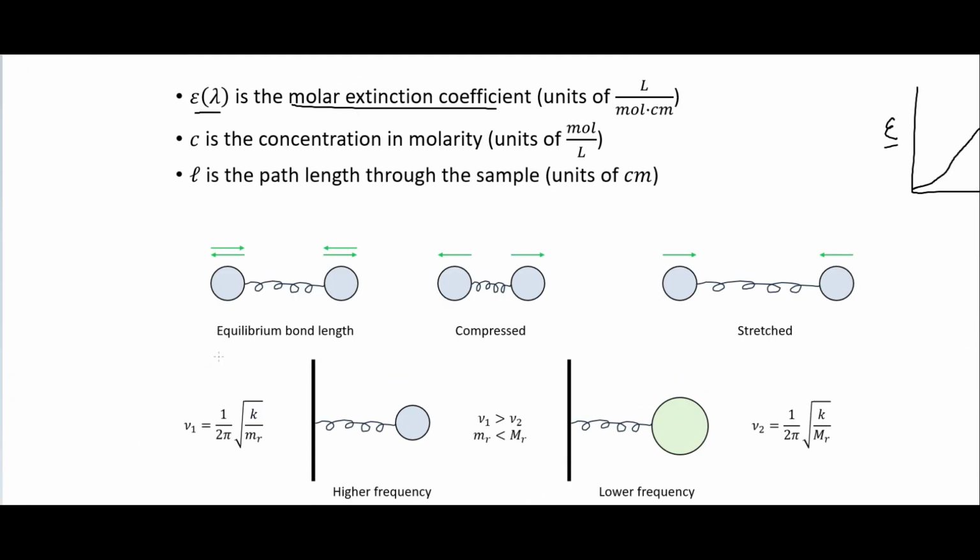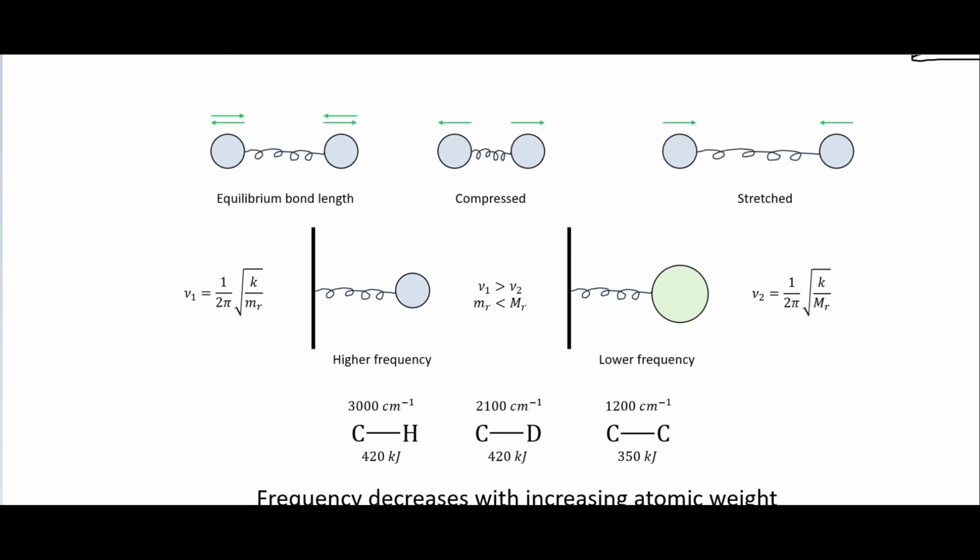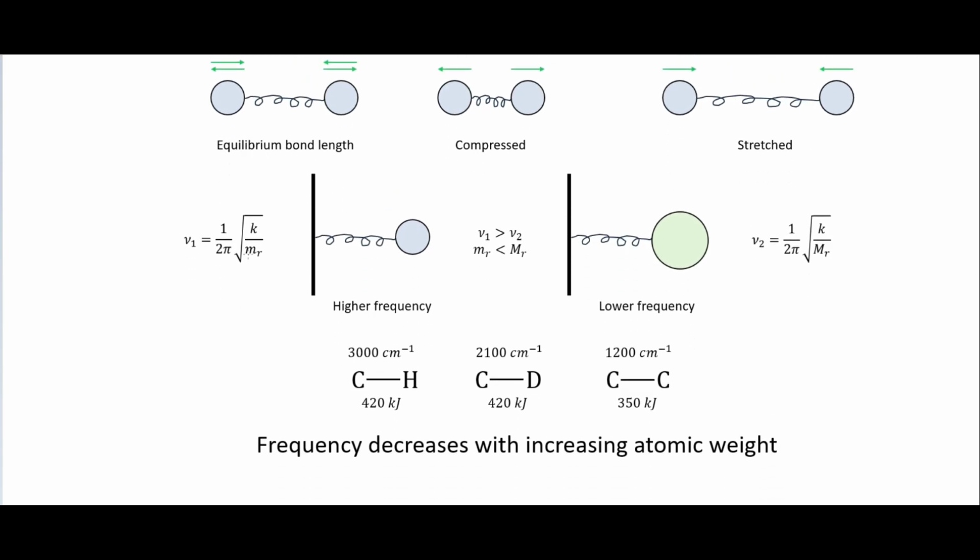All right, so what this means though, putting the two things we've been talking about together, which is the vibrational modes and this absorption of frequency here. So we're looking at our atoms within a molecule vibrating, and there are many things, but two of the main things that are going to influence the vibrational mode are the K constant and the mass.